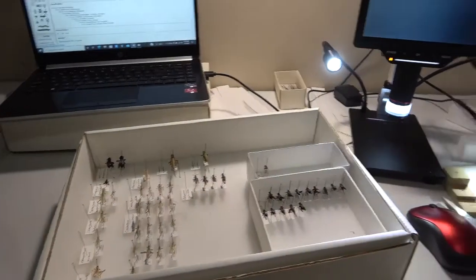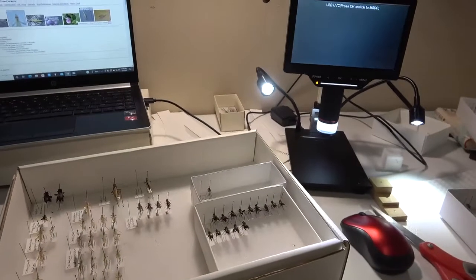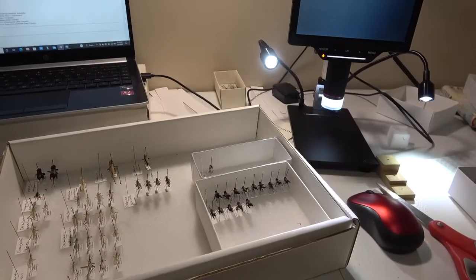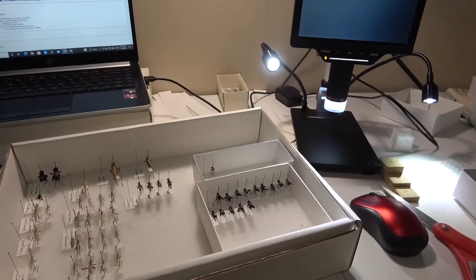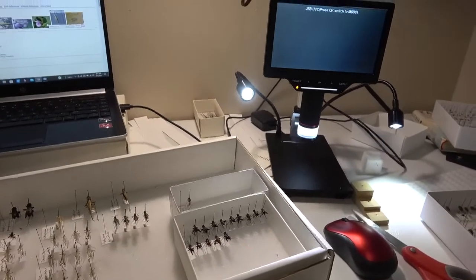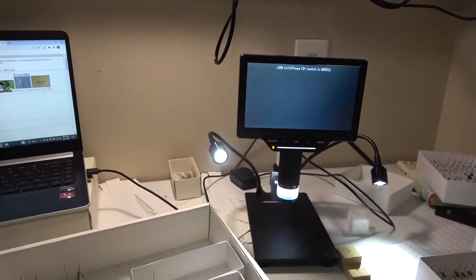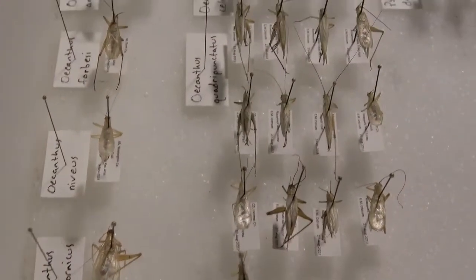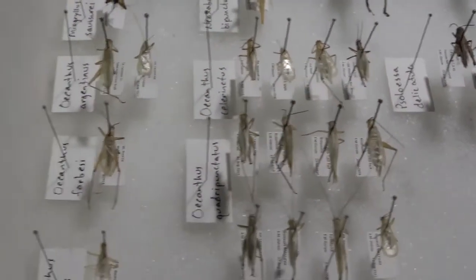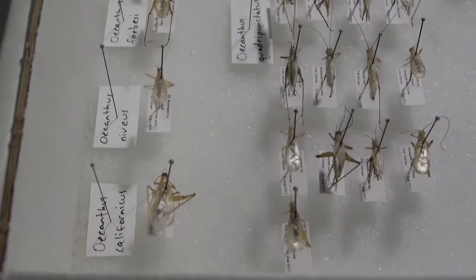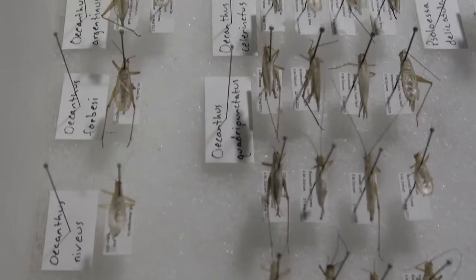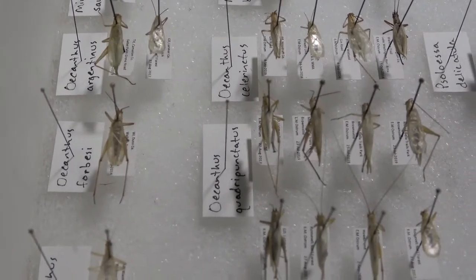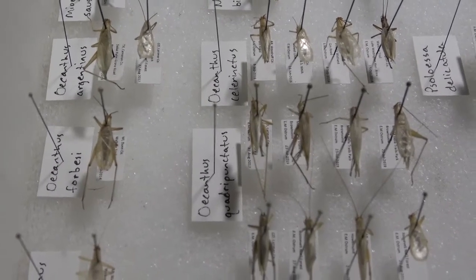Hello everybody, welcome to Daily Entomologist. In this hopefully short video, I'm going to show you a way to identify common tree crickets in the genus Oecanthus. It'll be the first video utilizing the video function on the microscope. I'll use the microscope to video and we'll take a look at the markings on the antenna, which help identify these crickets.